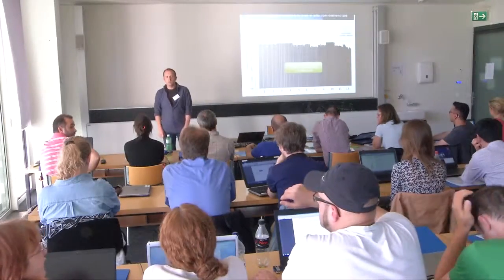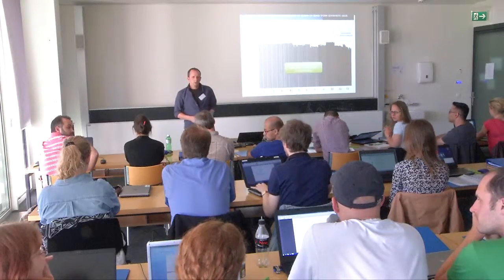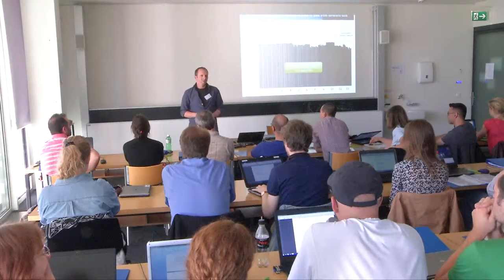Ralph? Just a very brief question about the 5600. You mentioned you have 25 m/z isolation windows. Is this the way you run the 5600, or do you normally? Not anymore. So how do you run it?